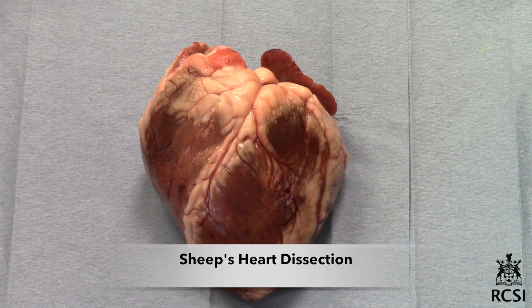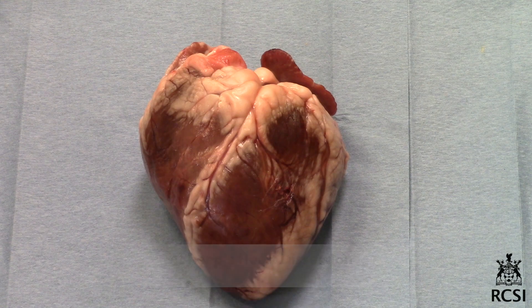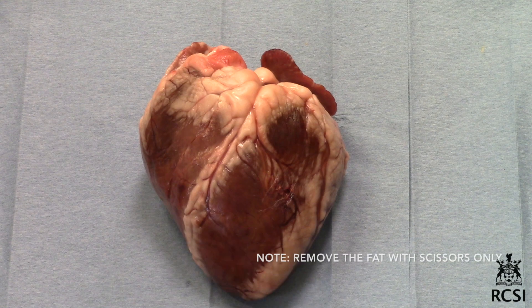Place the heart with the ventral surface uppermost on the dissecting tray. If there is fat, carefully remove it and any lung or pericardial tissue to expose the external features. Much of the fat may be picked away, but if you use the scalpel be careful with your fingers.